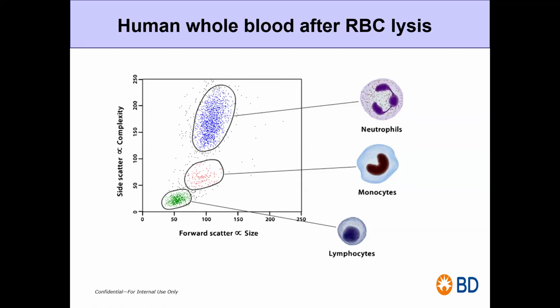Now this is the heterogeneous population. Let's come to the homogeneous. If you have a homogeneous population, let's say you are just talking about the lymphocyte, at that time, how will you get to know whether it is small or big? In that scenario, you should have a control. Let's say if you have treated your lymphocyte with something, then you should have an unstained or untreated control. You get to know whether it's affecting the size of that particular cell or not.